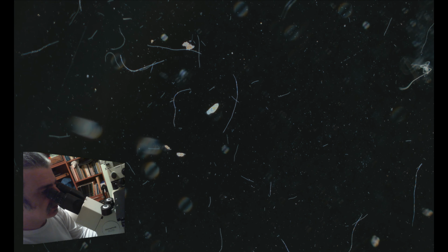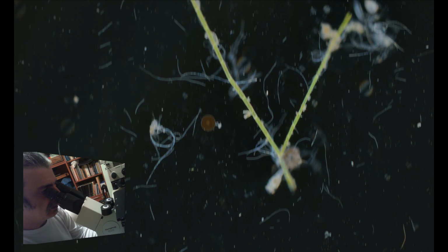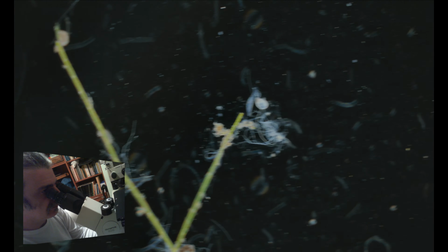also a ciliate from a different class. This one is a rotifer. Arcella. Some algae with rotifers around it.